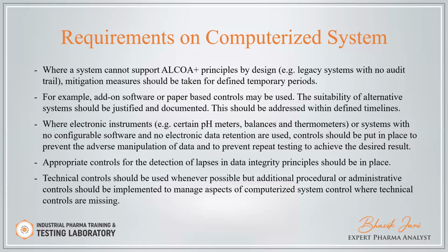It means you have to give some procedure control to justify the partial or non-compliance system, but it should be a temporary period.